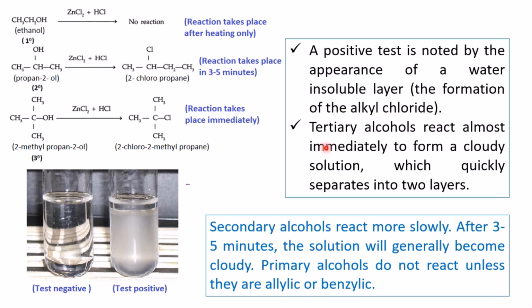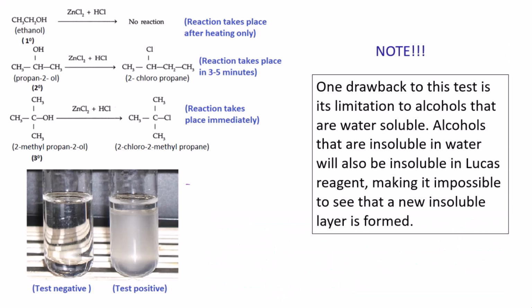Tertiary alcohols react almost immediately to form a cloudy solution, which quickly separates into two layers. However, primary alcohols do not react unless they are allylic or benzylic.